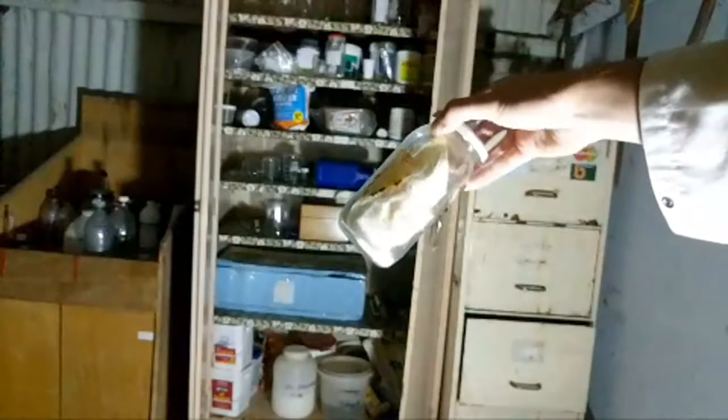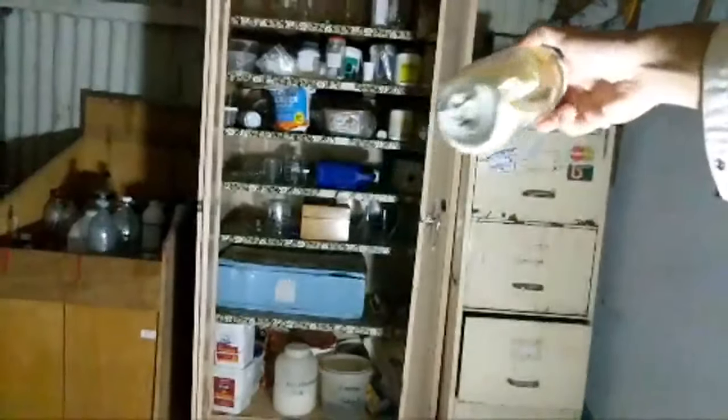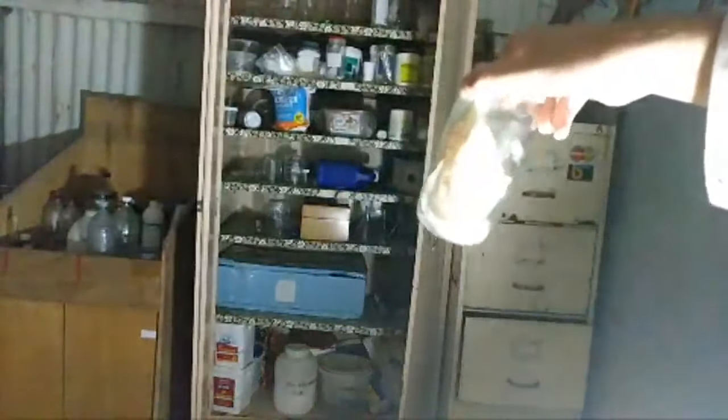Have a look at this. That's some iodine, definitely leaking in there. Look how yellow that is. There used to be some white paper towel. Once again, yellow chemistry. Things have gone yellow. It means it's bad.